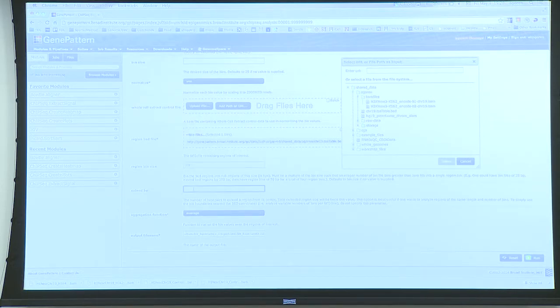And extend by means that it takes the center of the bed file and extends it 2.5 kb in each direction. Now, since the file is the transcription start site, for prokaryotes we really know exactly what the promoter is. For eukaryotes, it's not super clear, but the convention is something like the 5 kb around the TSS, around the transcription start site. So we take the transcription start site and we extend it 2.5 kb upstream and downstream. This is why we extend it here by 2.5 kb.